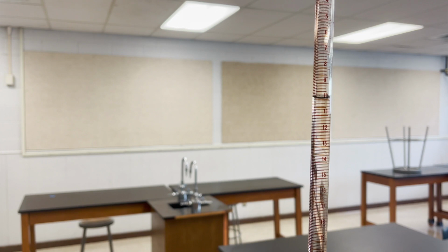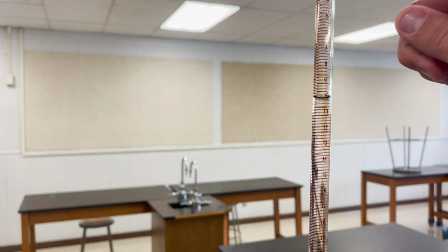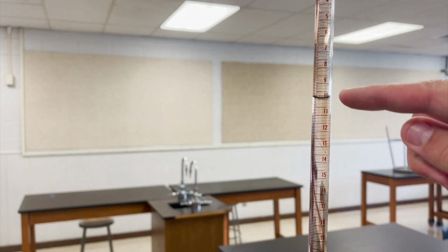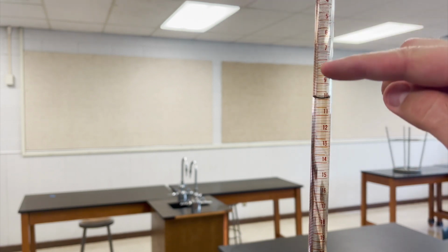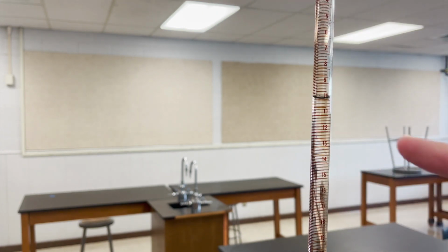The meniscus is touching just the line there. Now again, remember it started off at 0 and now it's at 10 milliliters. The reason why it's increasing going down is because it's telling us how much of the sodium hydroxide we've put in. And so that's why it starts off at 0.